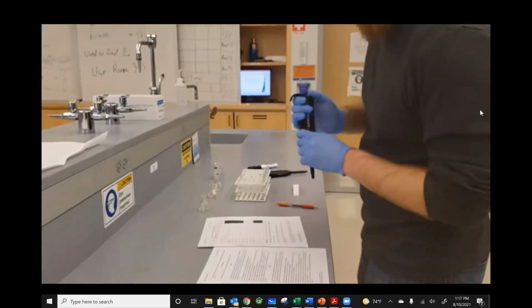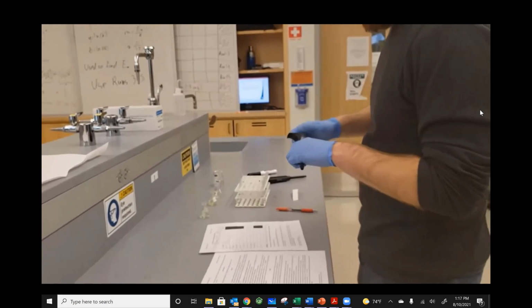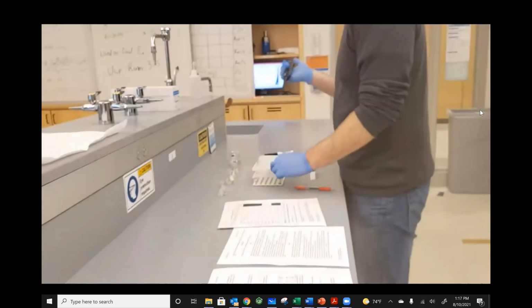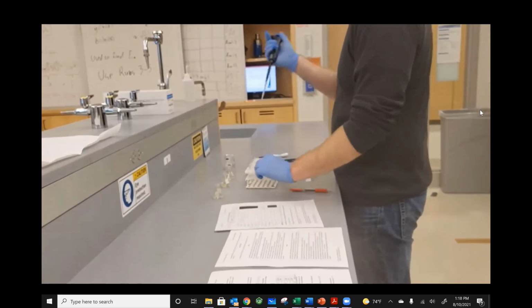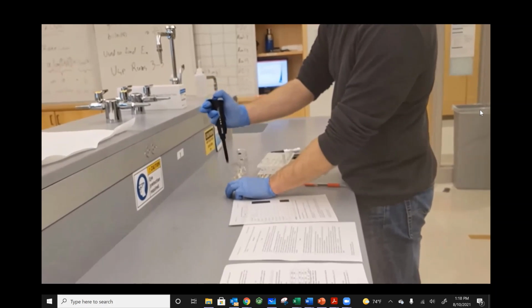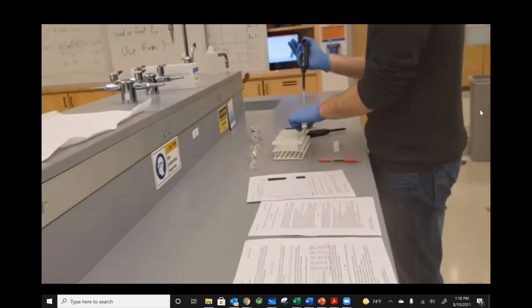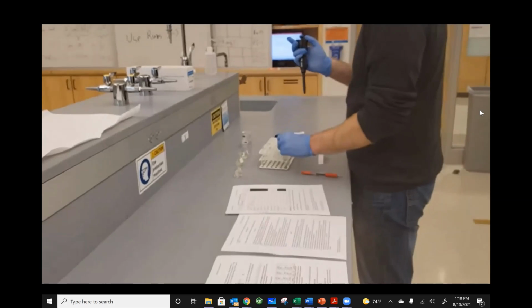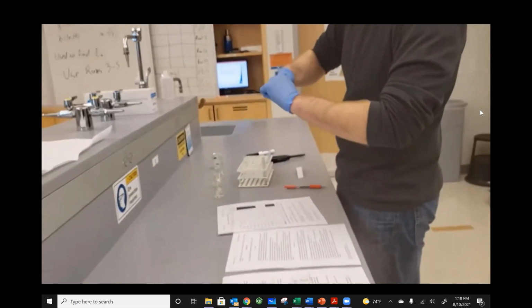This next trial, I need 600 microliters of hydrogen peroxide. I'm going to collect hydrogen peroxide and move them back there so they don't get confused. 600 microliters of hydrogen peroxide. Check the price. Put them all in. Adding it to the test tube for trial 2. Place this tip. This one I only need 200 microliters of water.